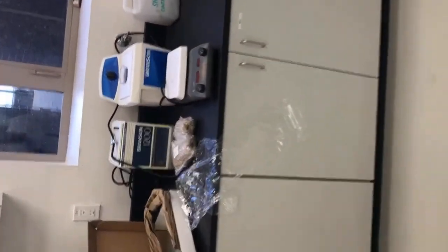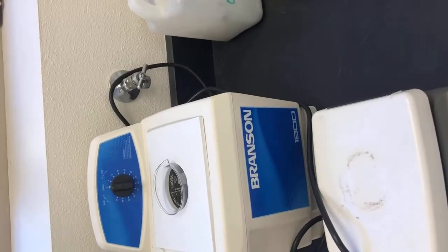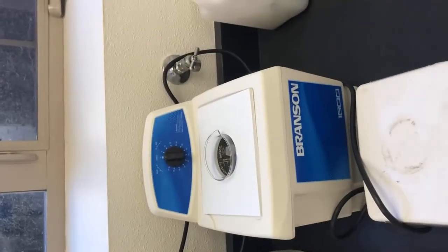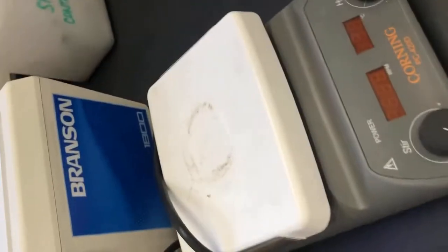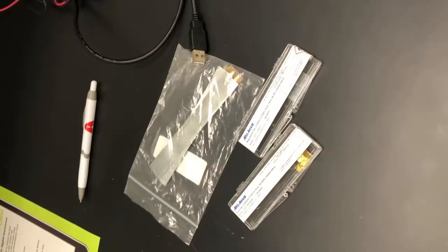Over here near the sink, we can also find another sink. We have here — basically not a vortexer, but a sonicator. You can use it to clean glass equipment; it's used a lot for serious electrochemistry. There's a hot plate — we are going to be using that in our DSC lab. And here are some corrosion samples that we'll be using for our corrosion lab, so more on that to come.